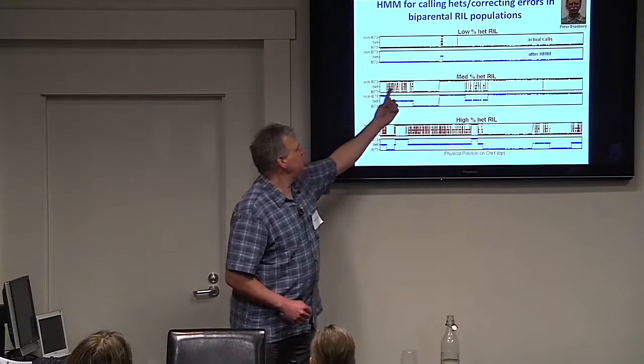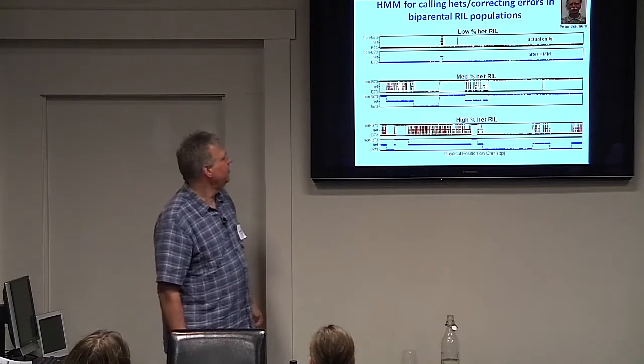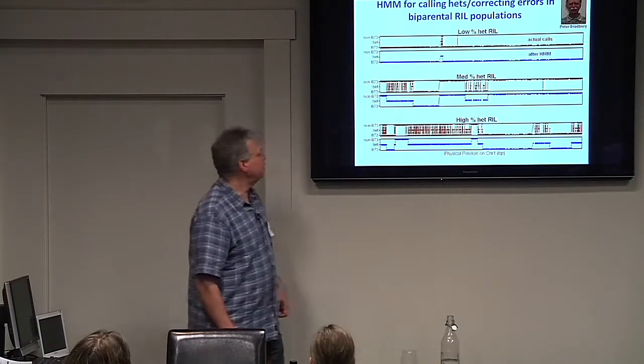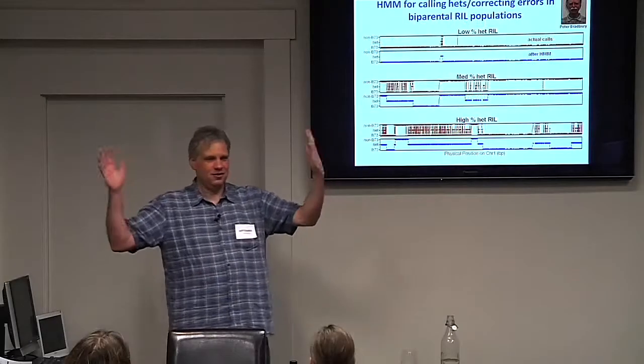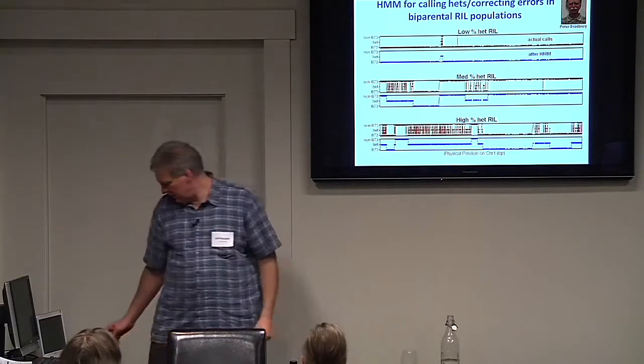So this is an obvious signature of a heterozygous segment, and Peter's algorithm can recognize that and call that whole thing heterozygous, and then just fill in between any 2 points that agree on either side. The missing data in between just fills in to what the flanks are called. So that's basically how his thing works.